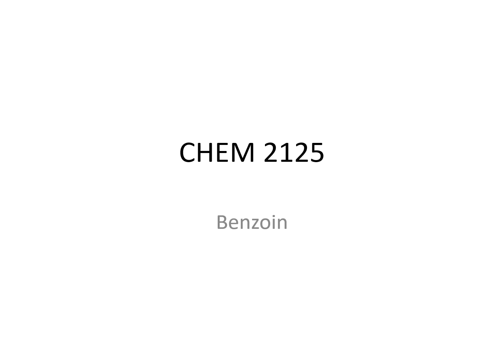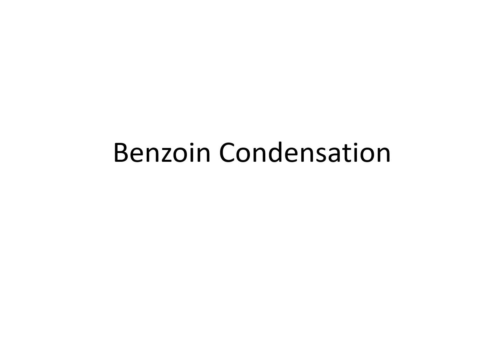Hello guys, this is the Chem 2125 Practical Organic Chemistry course, and this is a lab lecture for that course. In this lab lecture we'll be looking at the synthesis of benzoin. Specifically, the benzoin condensation is where we refer to the synthesis of benzoin from two aldehydes.